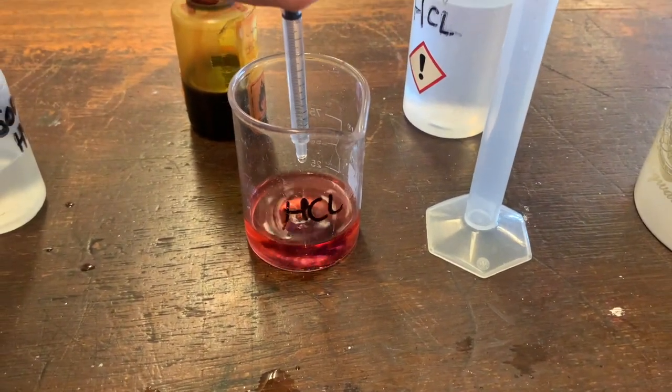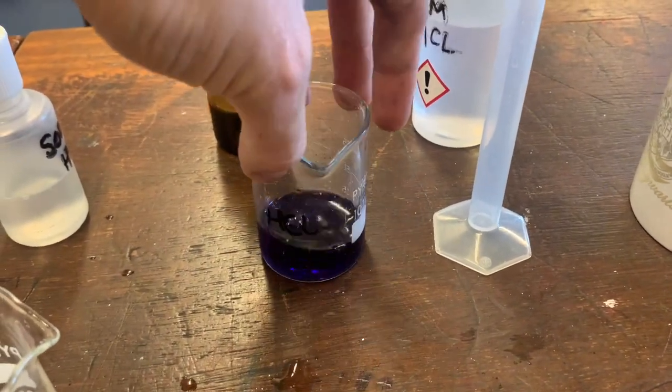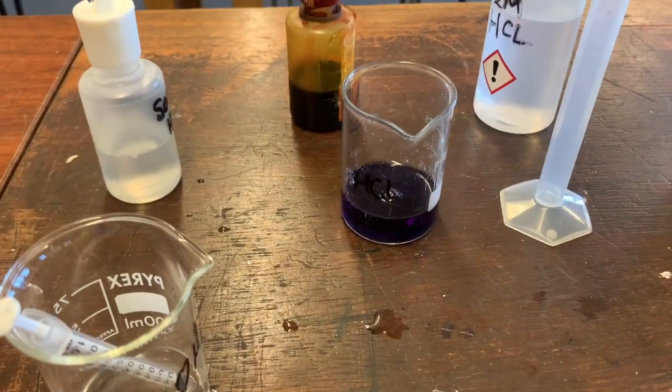Let's go for another milliliter — there we go, big change, all the way to a 14.